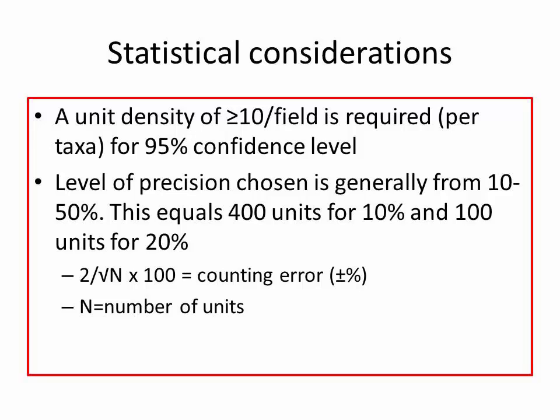I hope it'll work when we sit down and look at it. Yeah. If you count 10 of something per field, and you have predetermined this is how I'm going to do my monitoring, whether it's cells or natural units, then you're okay in terms of statistics. Okay? Clear?